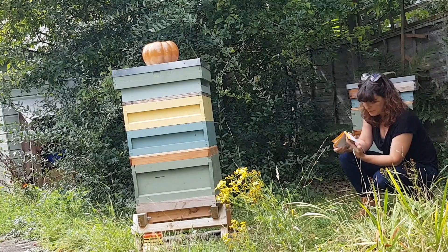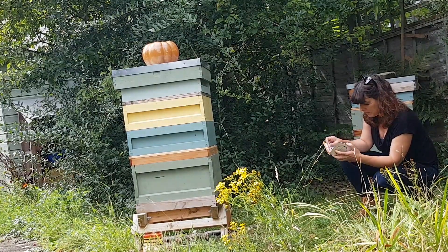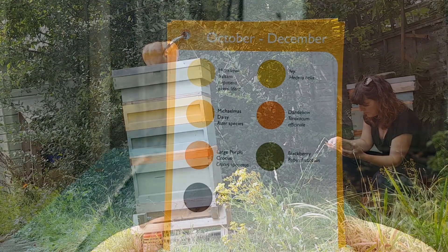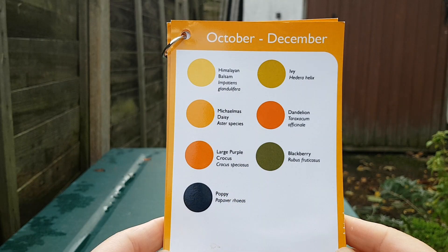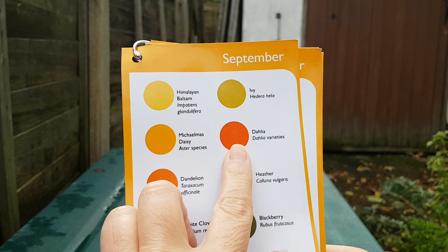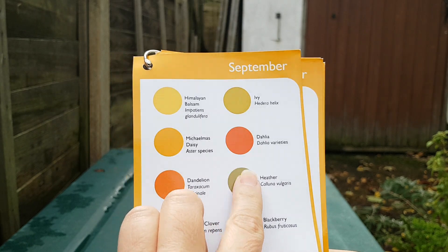And even then, how will I know what pollen I'm looking at under the microscope on these cards? So I thought over the following year it would be interesting to collect pollen samples from the plants on these identification cards each month. Let's divide this month into half and start with Himalayan balsam, ivy, michaelmas daisy and dandelion. Still in flower at the moment is dahlia, so I'd like to check that out too.